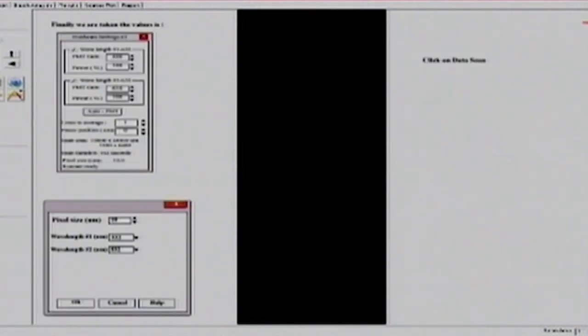First, you can preview the scan. And then you can adjust different types of settings to see the signals better. Then you can look at each region in the zoomed in view and look for the signal.